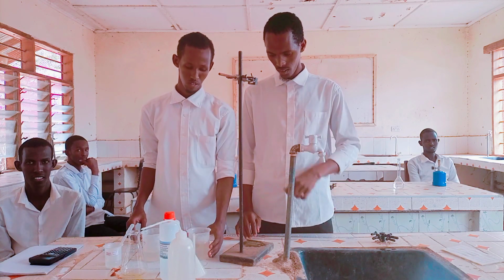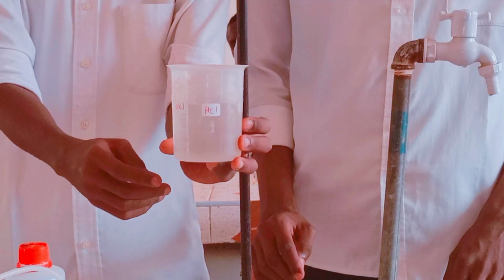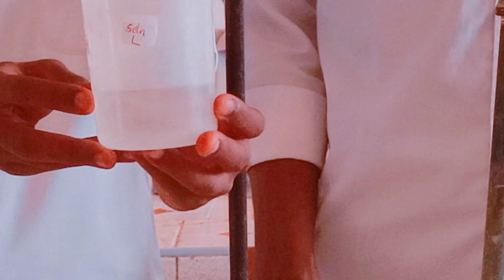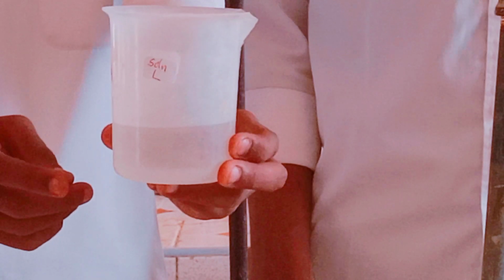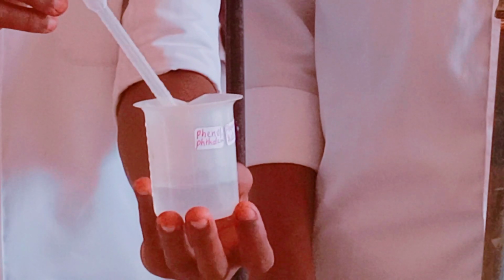Here you are provided with hydrochloric acid, which is labeled as solution N. Then you are also provided with solution L, which is sodium hydroxide and contains 20 grams per liter. We are also provided with an indicator, a phenolphthalein indicator, which is going to determine the end point of that reaction.